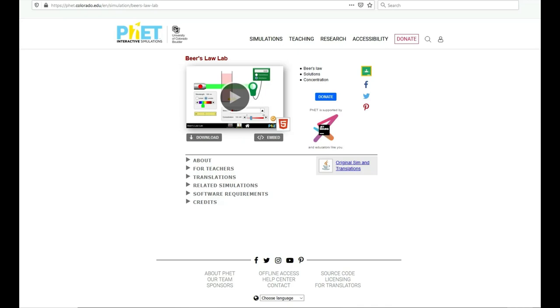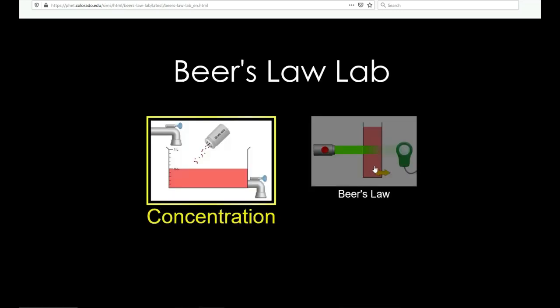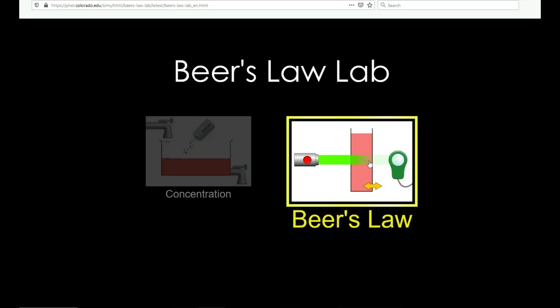In this virtual chemistry experiment, you will be using an interactive simulation to look at spectroscopy and Beer's Law. You'll be using the Beer's Law simulation.